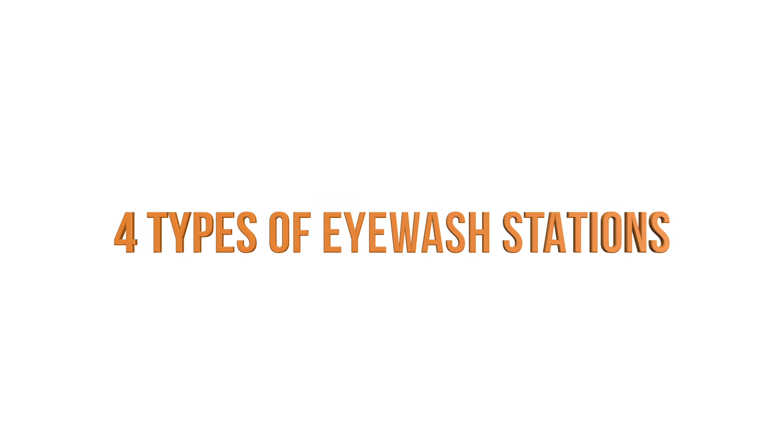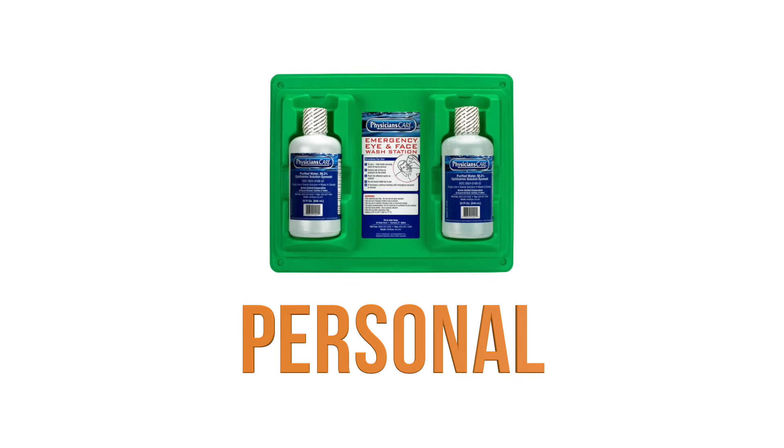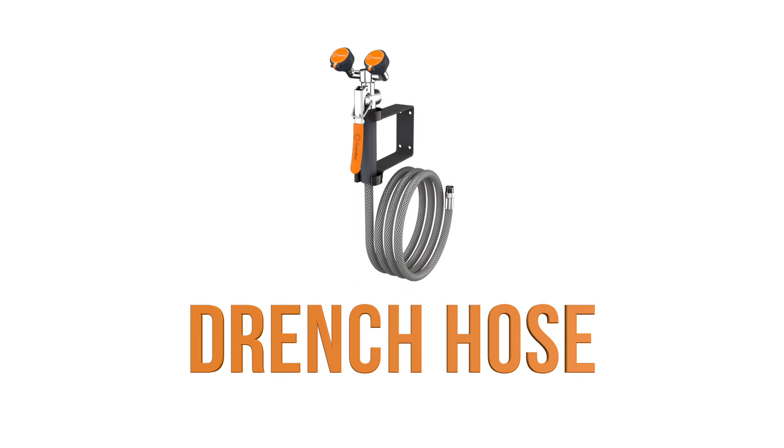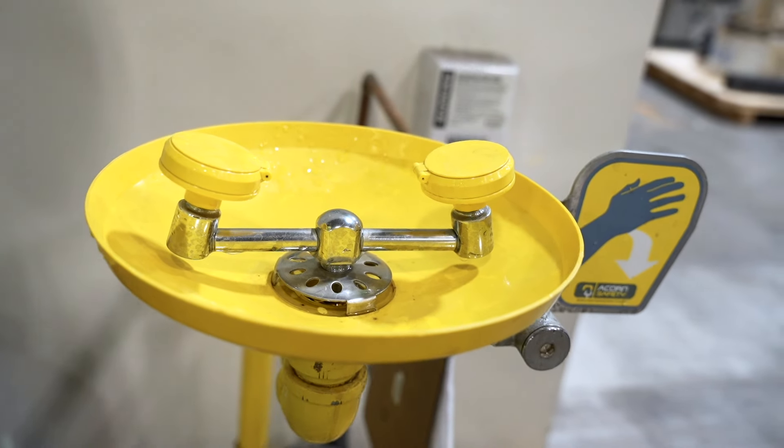There are four major types of eyewash stations: plumbed eyewash stations, self-contained eyewash stations, personal eyewash units, and drench hose eyewash stations. This video will focus on plumbed eyewash stations.